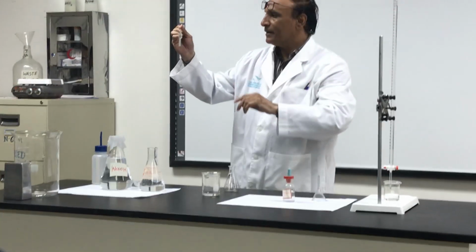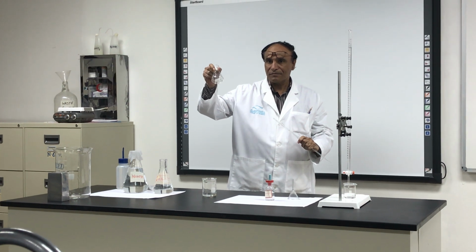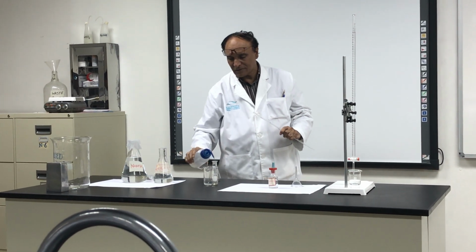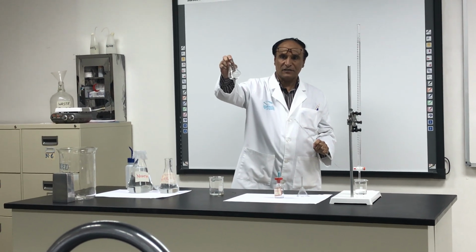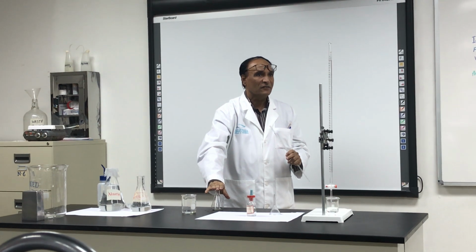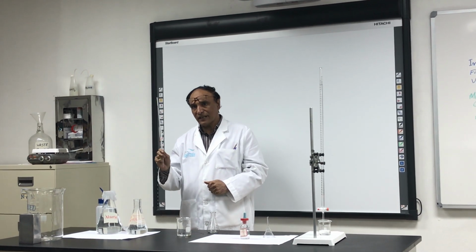So now it is washed with the vinegar. Don't wash this with the vinegar. This is washed with what? Water. I washed this with water. If there is water inside, it makes no difference, because it will remain here inside. So don't wash this one with the vinegar. Only with water. This one will be washed with water and with the vinegar.